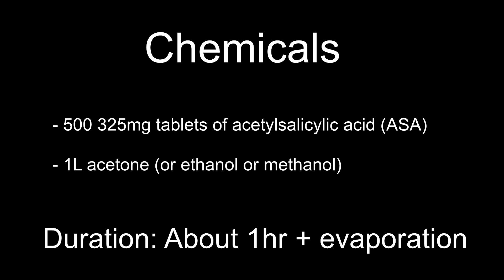When choosing your tablets to extract from, look at the ingredients and try to find the tablets with the fewest extra non-medicinal ingredients. The tablets I used only contained starch and cellulose, both of which are effectively insoluble in acetone, which makes the extraction much easier and more efficient.